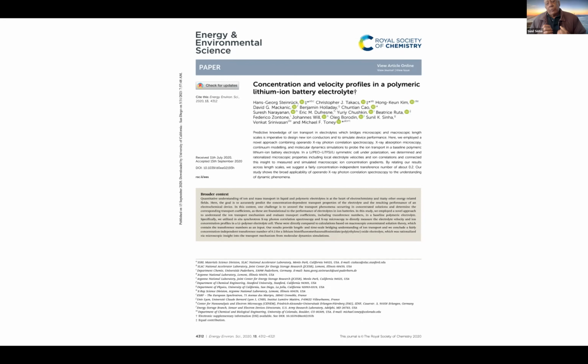When you're talking about particles diffusing in a film, we think it's obvious that we're seeing the particles diffusing in the film, but we may not be. In fact, in this case, we showed that what we were really seeing was the density fluctuations of the polymer around the particles relaxing after the particles had moved, because the particles themselves were too small and weak to scatter.